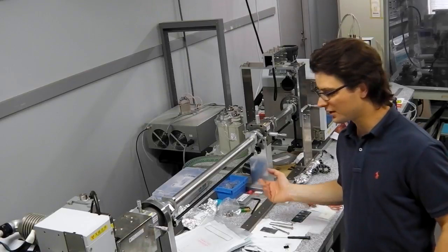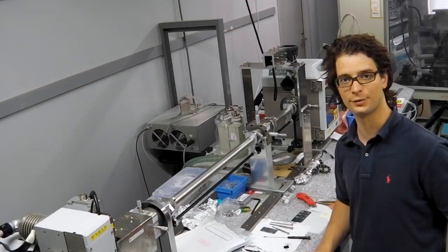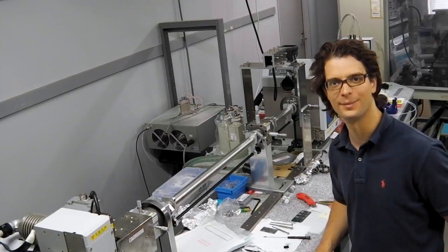So that's it. As you can see, it's a very straightforward instrument. But nevertheless, I hope that I've been able to explain a little bit about it. Thank you very much for listening.